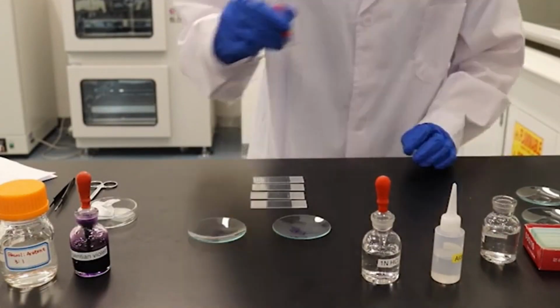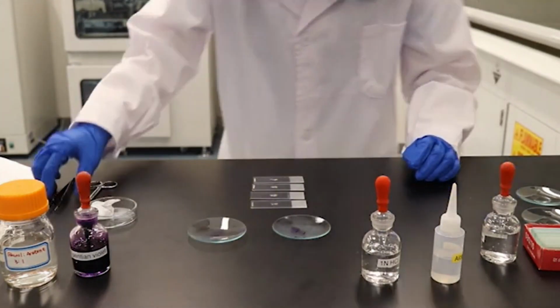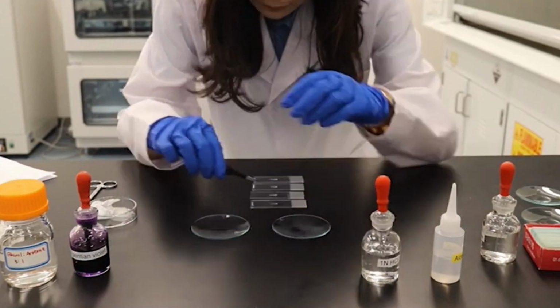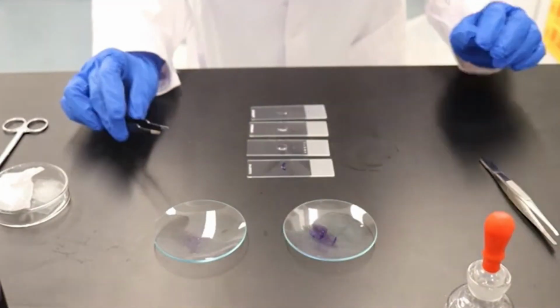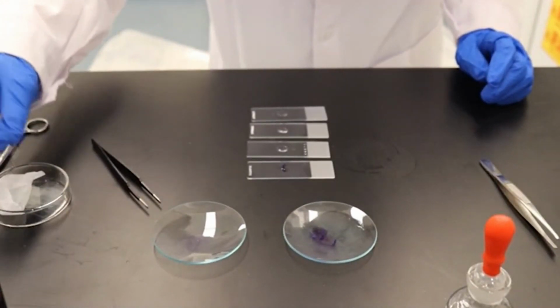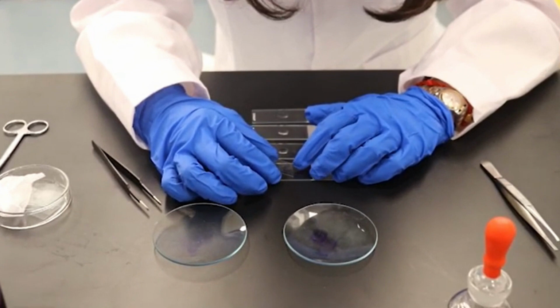Then, in the slide preparation stage, we place a single root on a microscope slide with water. By applying a cover slip and gently tapping the slide, the root tissue is squashed into a thin layer, so that the observation of the mitotic chromosomes will be much more recognizable.